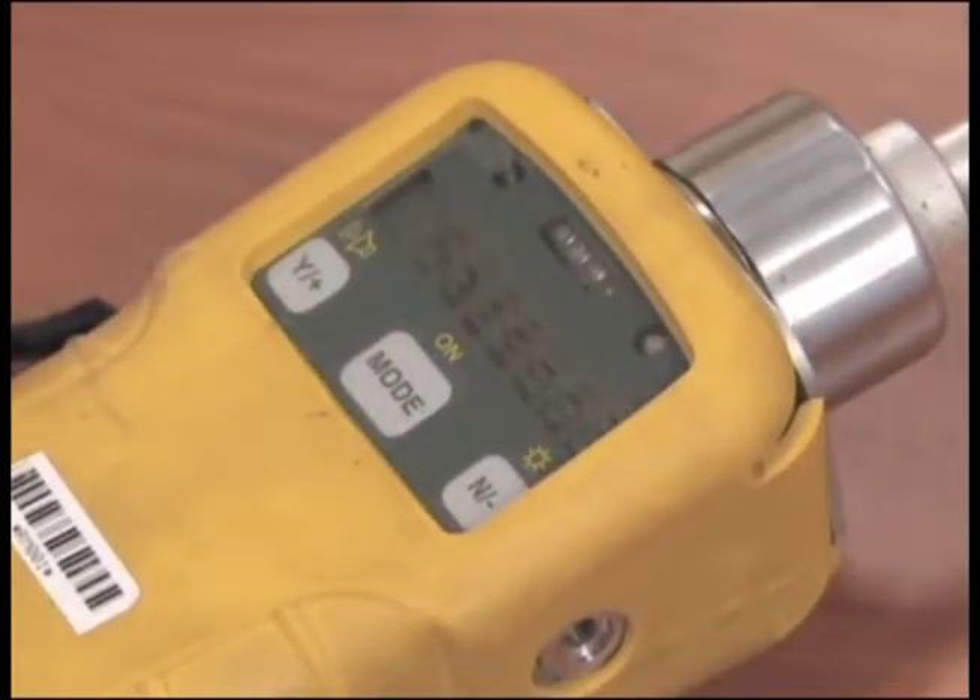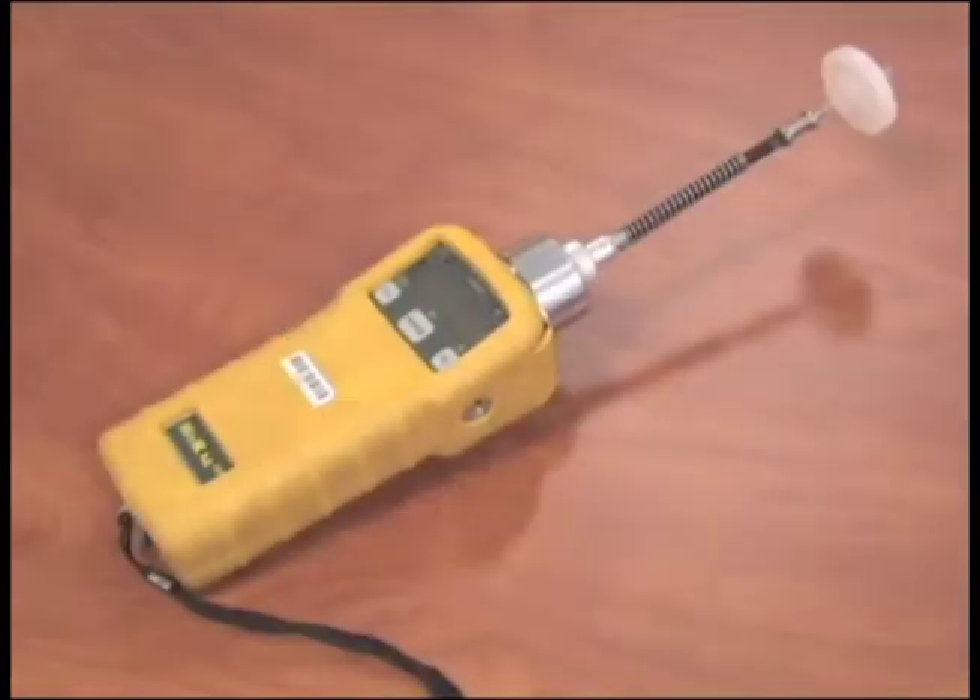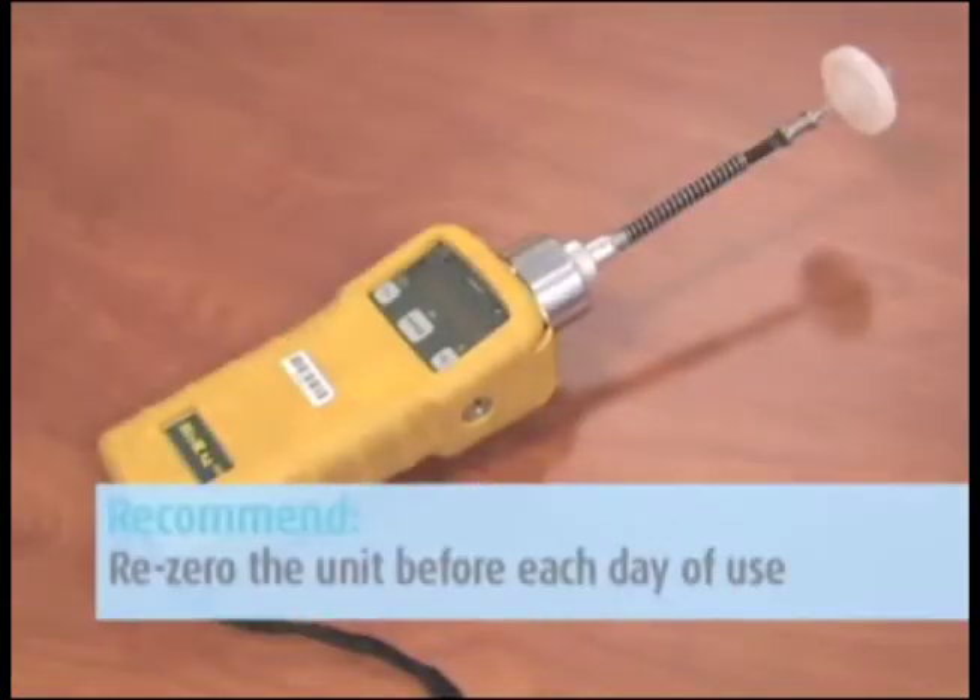Once the unit has gone through the diagnostic phase, it will begin to take readings and data log results. Although Galson Laboratories zeroes the unit before it goes out, we recommend that you re-zero the unit before each day of use.